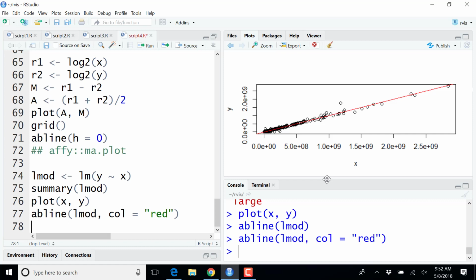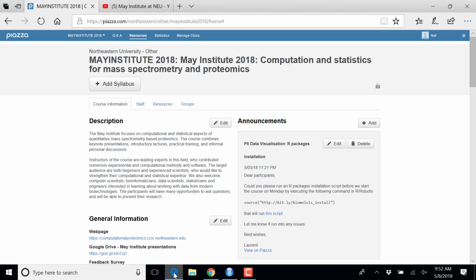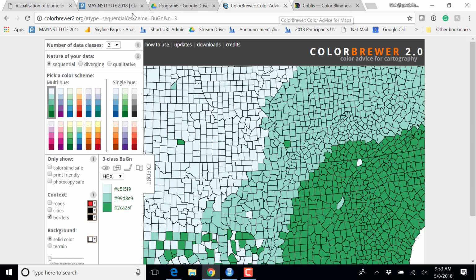So I suggest we move on from transformation, from comparing samples and linear models, to statistical plots. And there is one exercise that will actually answer your question from before, when we write our own panel functions. There is one challenge, but at the end of the day we have a practice session. So maybe we can keep some of the challenges for that.